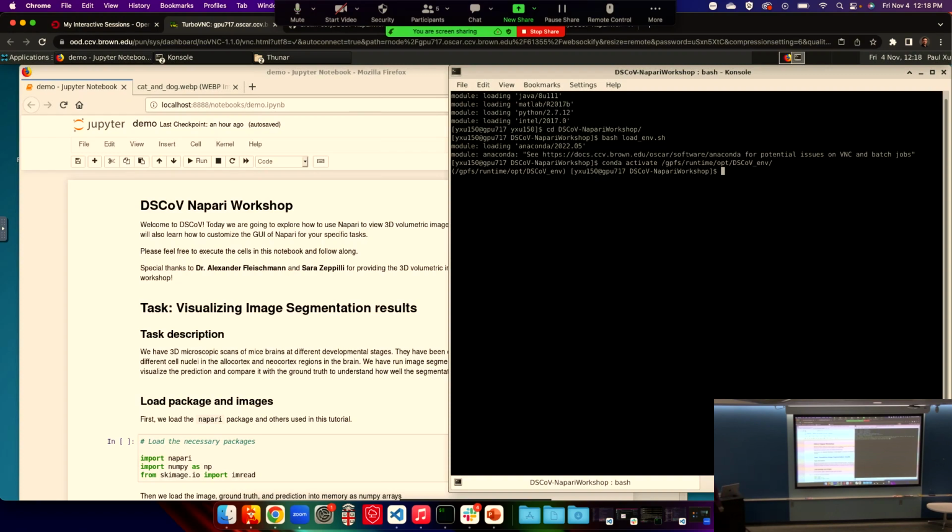Well, I wasn't even able to use Conda because I don't have it. I'm installing Conda, I just have the command. Okay. So you can use module load to load Conda here. Yeah, and then you will have Conda available to you. Yep.